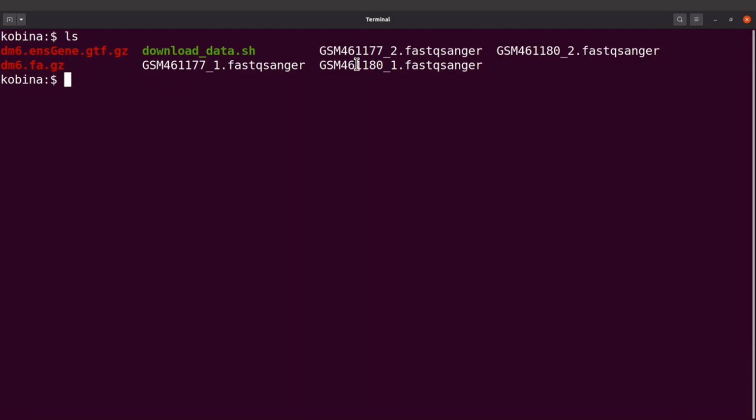Now we are going to place the fastqc files in another directory. So let's create a directory. We will say mkdir data. And then we are going to say mkdir data/fastq. I'm doing this so that I can group my files. It also makes my work more organized, and it's easy to locate files if you have naming conventions, and if you also have folders that you can put them in.